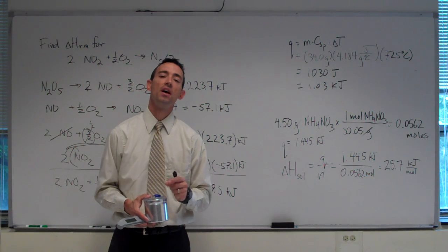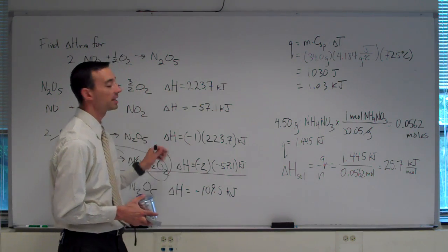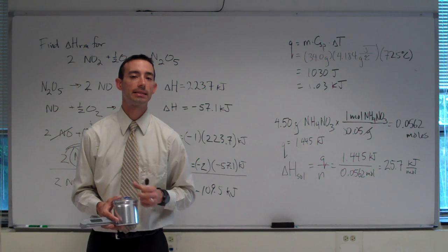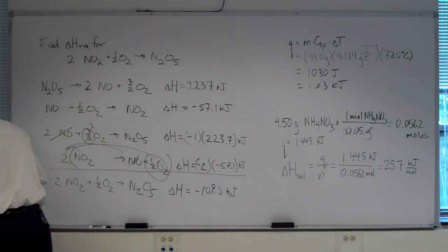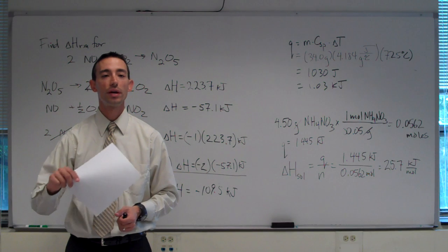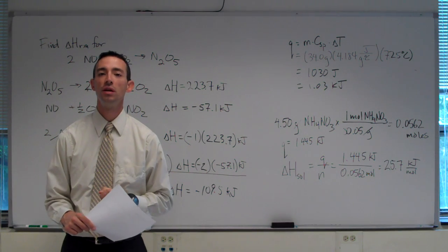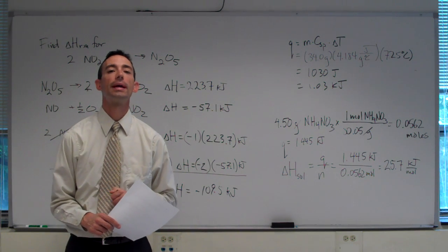We want a safe, good experiment today that really reinforces the concepts of calorimetry and Hess's law, and we don't want any accidents to take place. Also, as part of today's lab, you'll be getting a brief tour of the laboratory if you're new to this facility because you're a transfer student or a first-year student. So we'll run you through that, and we'll take a safety examination before we get started.